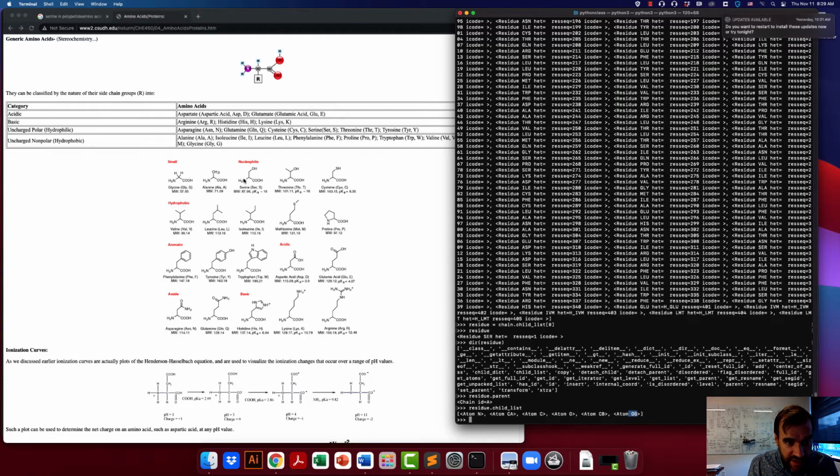And then you're going to have a nitrogen atom right here, and you don't have any of these hydrogens, and again that's because the hydrogen atoms are not present in the PDB file because they're too small to actually deflect. You should spend some time and make sure that you get used to understanding exactly which atoms you expect to see within a polypeptide chain, because I think that will be useful. There's the backbone, which is the same in all of the different amino acids, and then there's the side chain that will be specific for each residue.